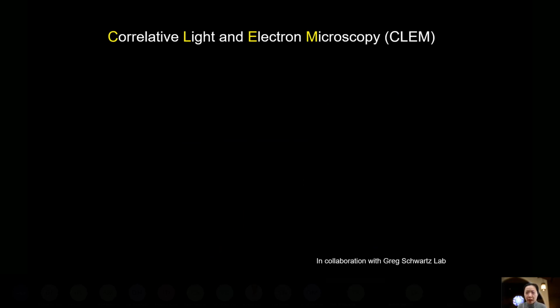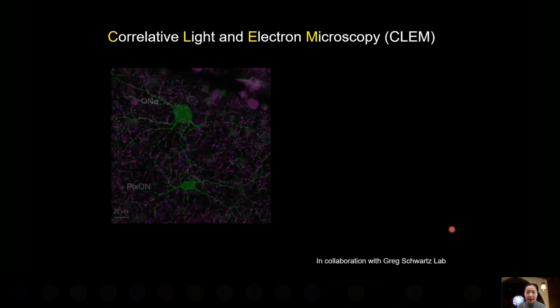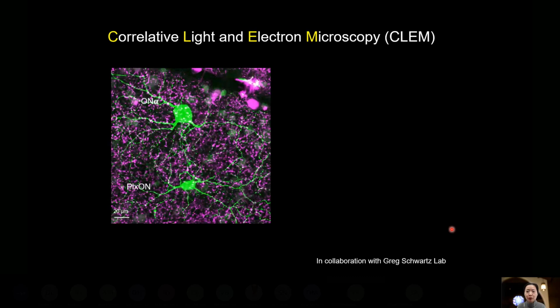So finally, we are also combining the SEM with light microscopy, largely because using the LM, we can identify and target cells of known structure and function for reconstruction. One reason to do so is to determine whether two neuronal cell types receive similar or distinct connections from one type of presynaptic cell.